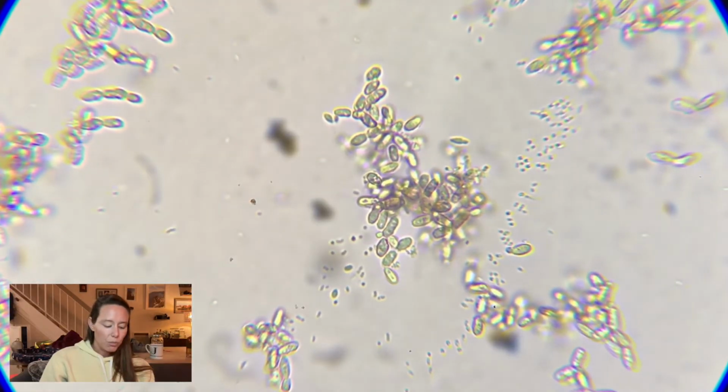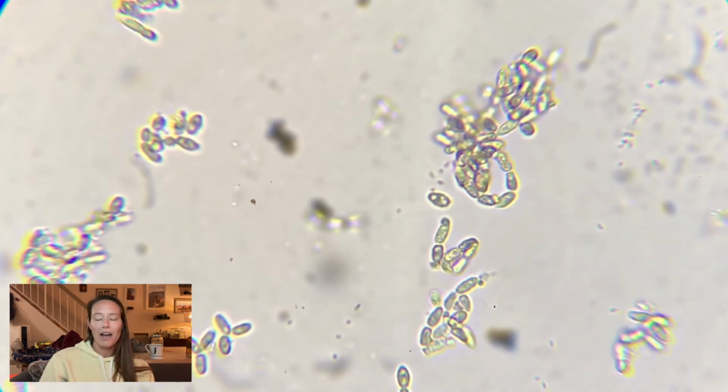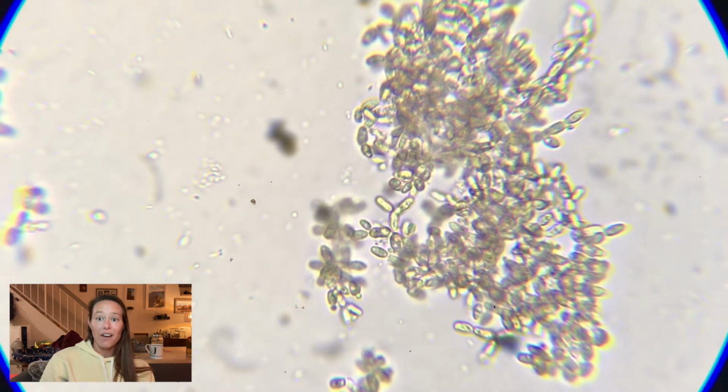After a couple of days, I took another look at the juice from these wild fermenting strawberries underneath the microscope. And again, the yeast had seemed to change. They had much more of an elongated cell shape as well as apiculate. And I was no longer able to find the dancing bodies within the vacuoles.